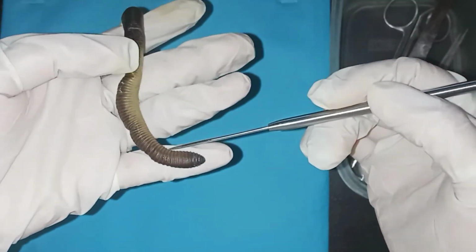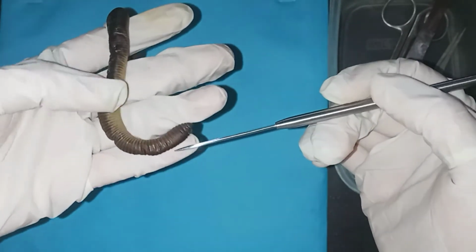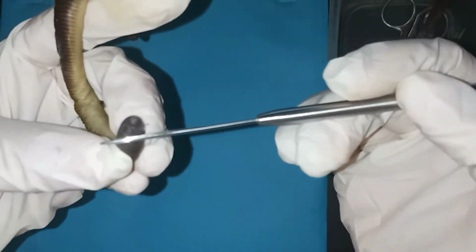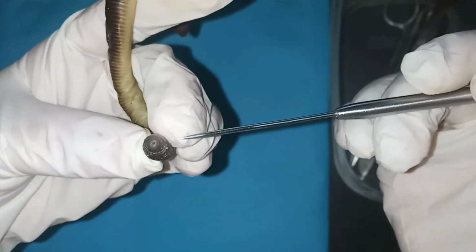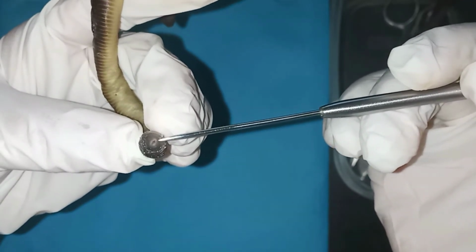This lower part of earthworms is called the posterior end. It is the part that is far from the clitellum. The anus of earthworms is also located in the last segment of the posterior end. So this is the anus of earthworms.